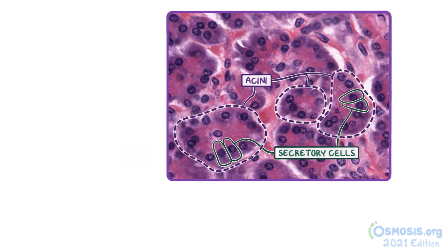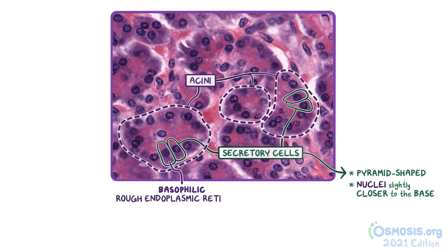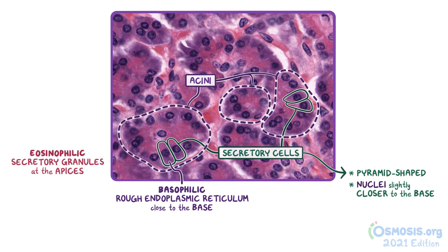We can see that the secretory cells are pyramid-shaped, and their nuclei are found slightly closer to their bases. This slide was stained with H&E, which allows us to see the purple basophilic rough endoplasmic reticulum seen closer to the base of each secretory cell, and the pink eosinophilic secretory granules at the apices are inactivated enzymes called zymogens.